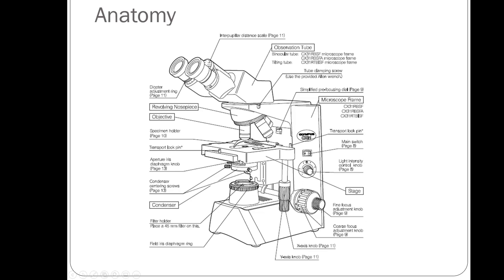So other parts of the microscope that you can see here, this is the stage where you'd actually put the slide that you're looking at. And there's a little spring contraption right here that will lock the microscope slide in place so you can move it around as you wish. If you want to move the microscope slide around to center what you're looking at or look at a different part of the slide, you use these 2 knobs right here. So the XY adjustment knobs. One of these moves the stage right to left, and the other one moves it front to back. So that way, when you get comfortable using the knobs, you can maneuver the slide however you want.